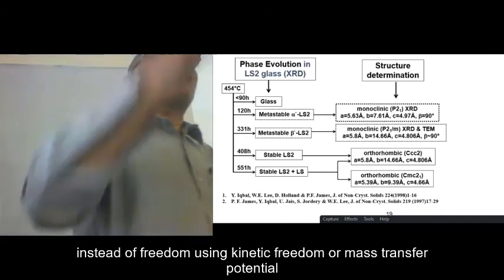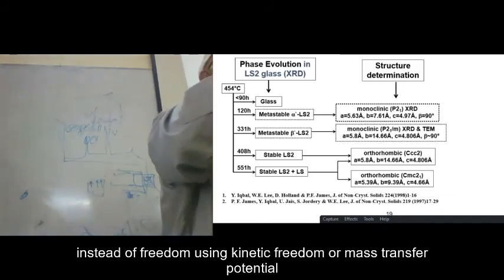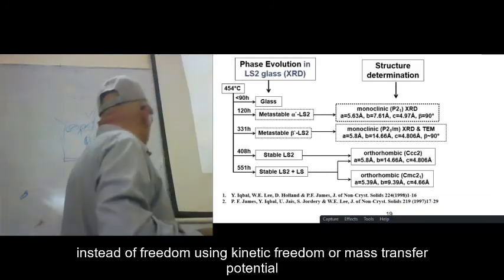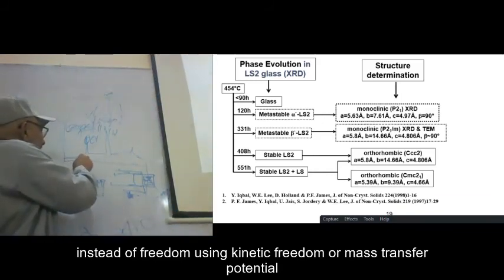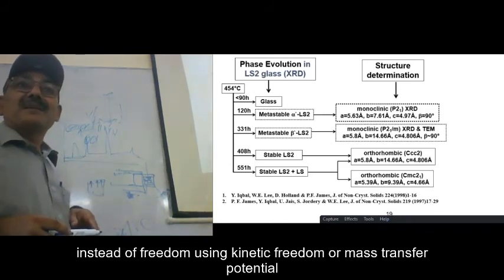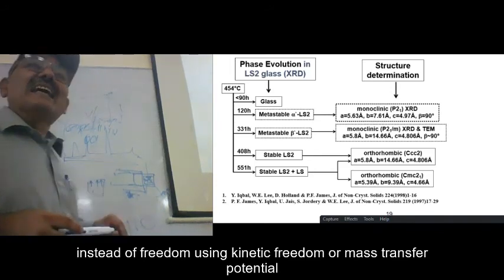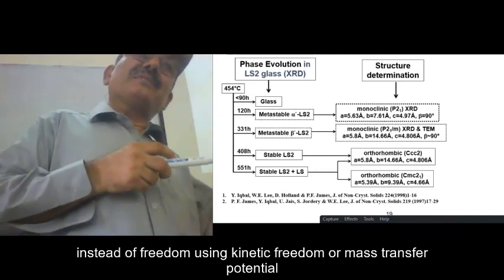If they are not meeting that condition, then it will not diffract. It will diffract, but the diffracted beams will destructively interfere and there will be no intensity. Common sense says that when X-ray is coming here, why don't we have a peak here? This is because at these angles, the Bragg's diffraction criterion is not met.